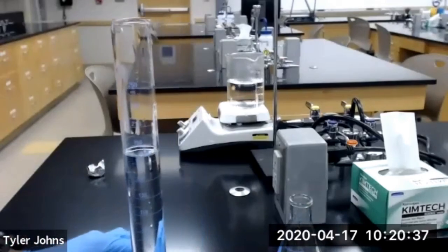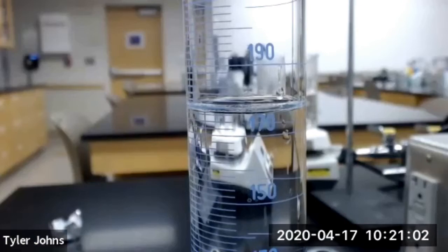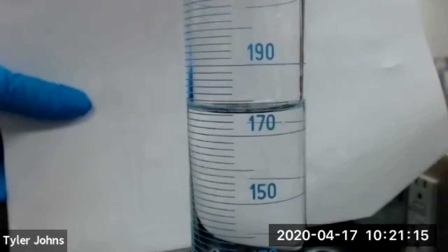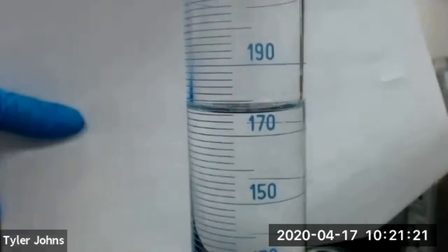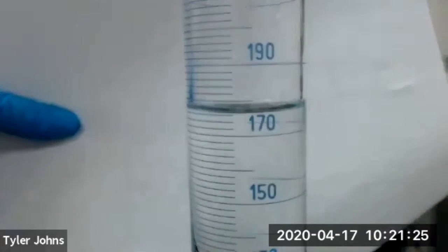We can zoom in here. The graduated cylinder actually looks to be holding right about 176 milliliters, and that's the volume of our Erlenmeyer flask.